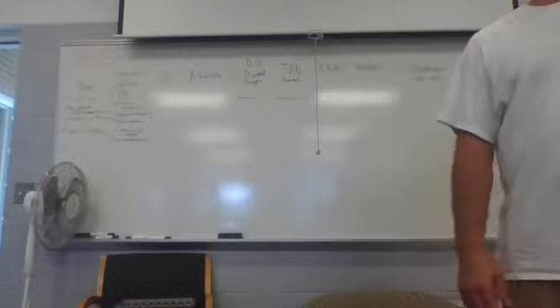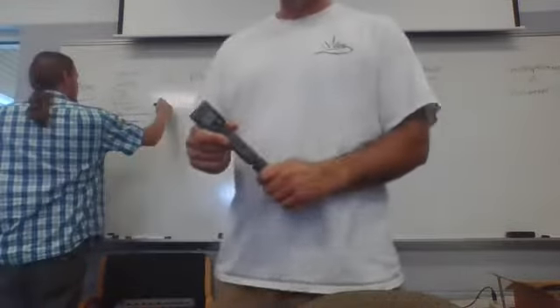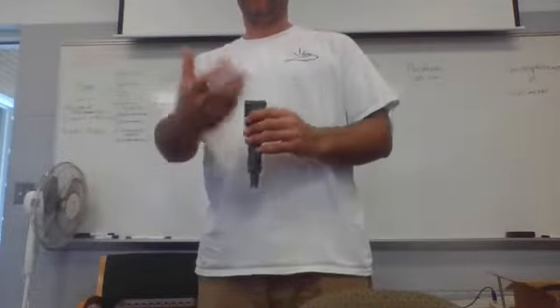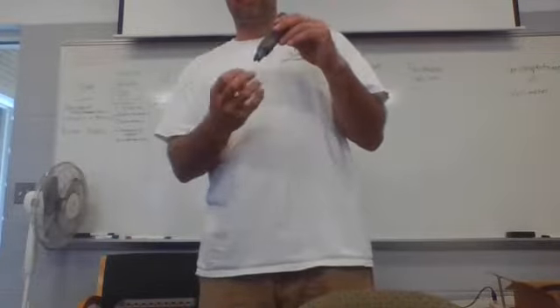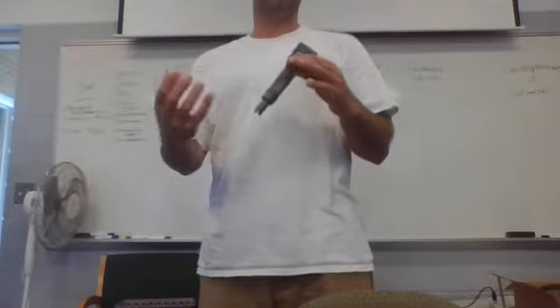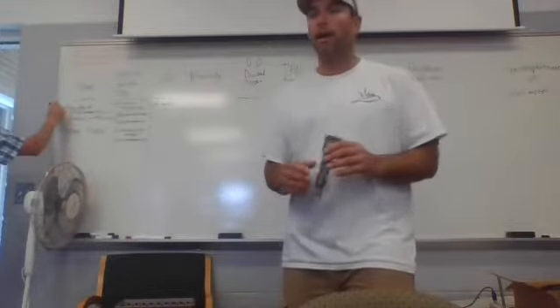All right, pH. pH meter. A pH meter, all right. So this is a pH pen, which you can get, and same idea, a pH probe that you can attach to any kind of handheld meter. It has a little glass ball on it, and it measures by electrical current, basically how many of those hydrogen ions are around it.